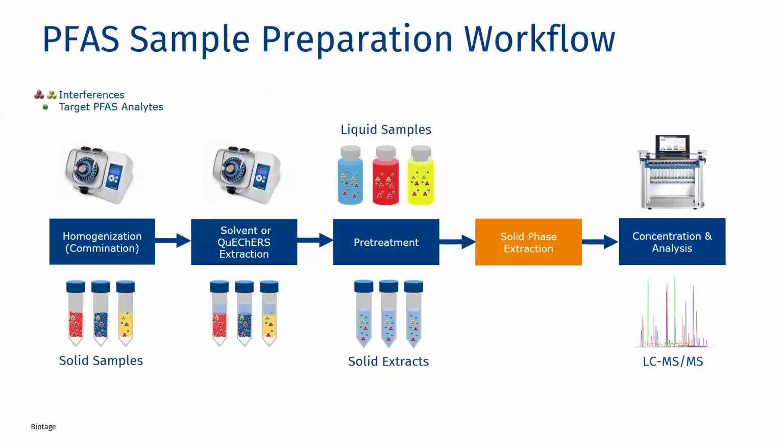So here's an overview of the PFAS sample preparation workflow. Whether you're processing solid samples or liquid samples, your process traditionally goes through the same workflow and eventually ends up at solid phase extraction. And this will be the highlight of today's presentation as we dive into some of the automated platforms offered by Biotage.